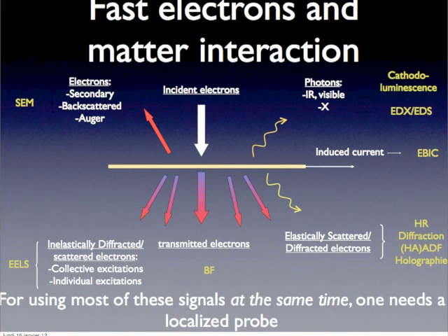Of course, it is also with this kind of electron combined with transmitted beams that you will do holography, with a nice French termination. Up to this point, I think it is almost the only kind of signal you have seen in this lecture, if I'm not wrong.